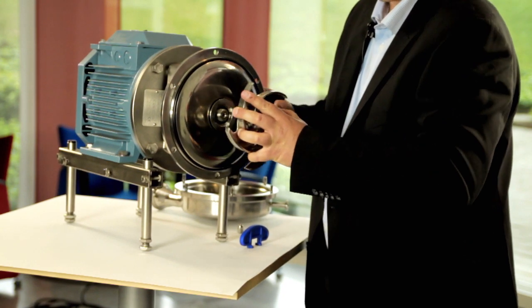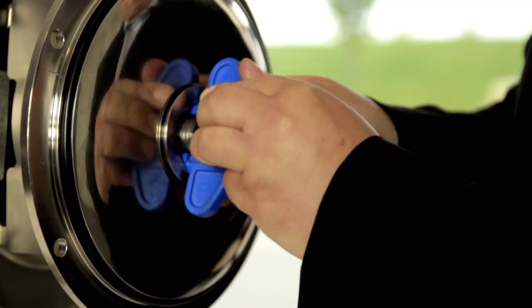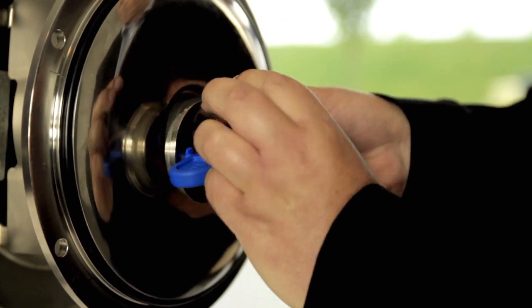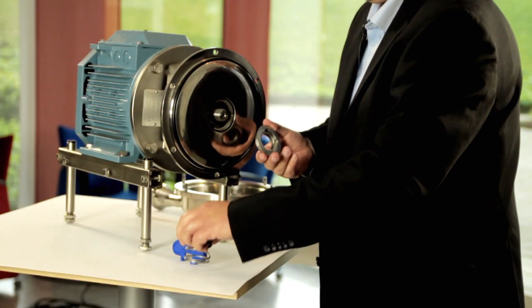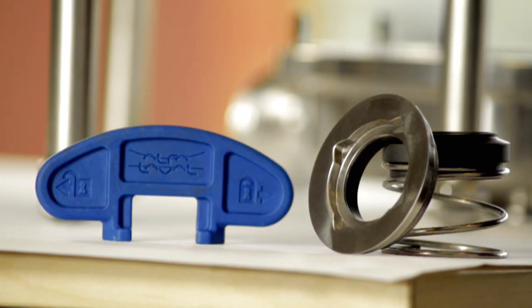Many pumps have an internal seal, which means a contamination risk. The LKH Ultrapure is different. It features an external seal solution, which makes it easy to clean and minimizes the contamination risk.